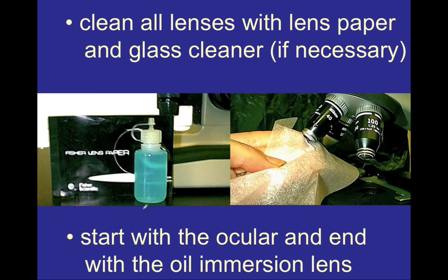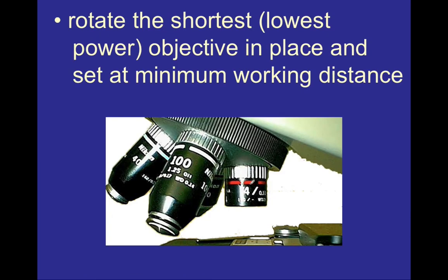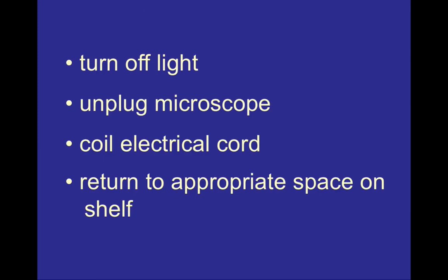You'll typically find glass cleaner and lens paper in the lab to wipe off the objective and ocular lenses before putting your microscope away. It is good practice to start by cleaning the ocular lens first, then moving on to the scanning objective lens, the low power objective lens, and then the high power objective lens. If you've used the oil immersion lens, clean that one as well. For the next student, always reset back to the scanning objective lens. Don't forget to turn off the light, nicely wrap up the electrical cord around the microscope, and bring it back to its assigned location in storage. Each microscope has a number — this helps us keep track of them and identify any damage.